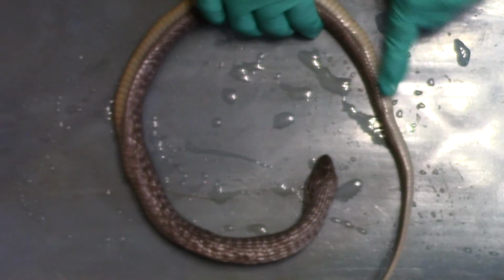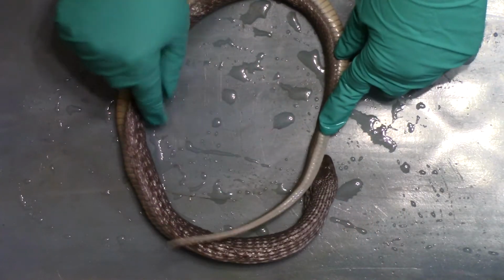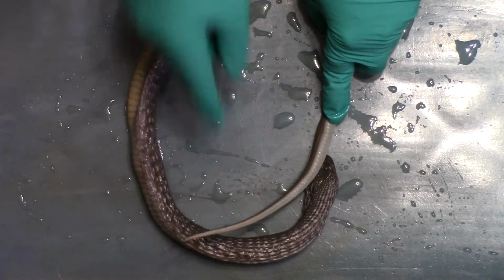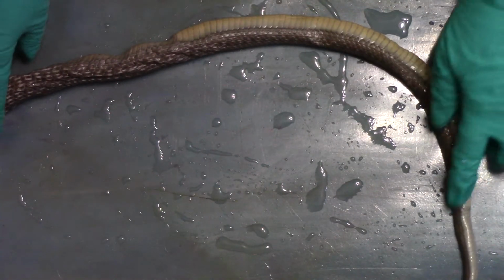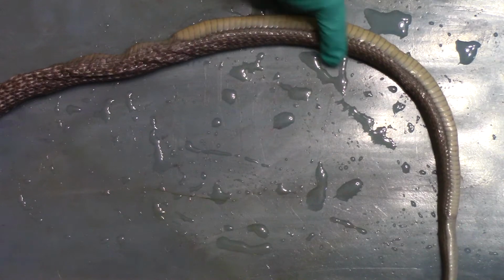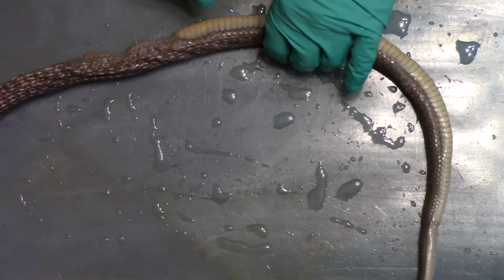So the tail of the snake starts from here down. It's just that end bit. The rest of it is the body, and it will contain vertebra and ribs. Some snakes you can see a vestigial pelvic girdle.